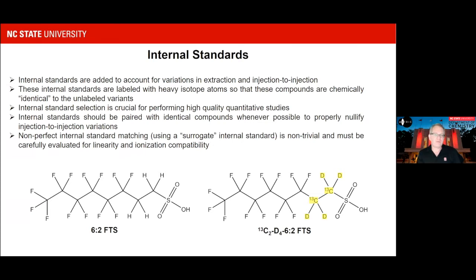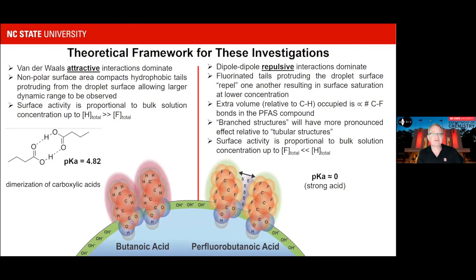I mentioned there are already 5,000 compounds in the environment that are known, but there's no way we're going to develop 5,000 stable isotope labeled internal standards. I'm sure CIL would love to do that, but that would break the bank. So we set up an internal standardization process by which we have matched internal standards, but then we have good surrogates, and we wanted to test that out.